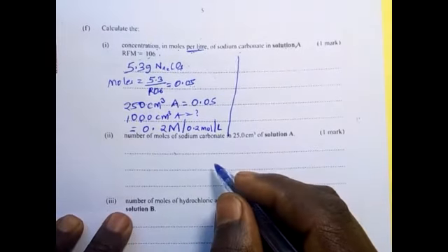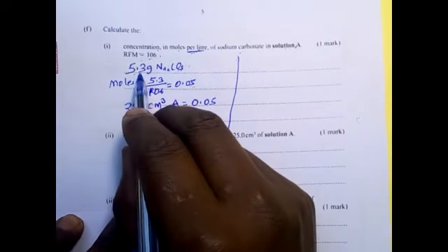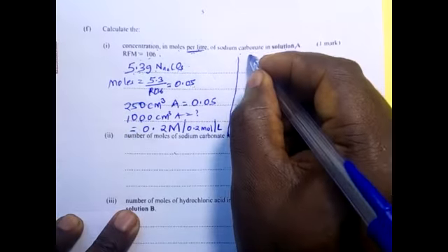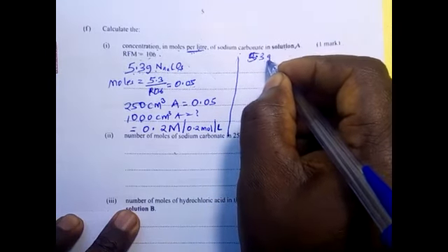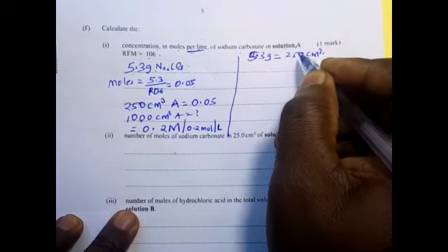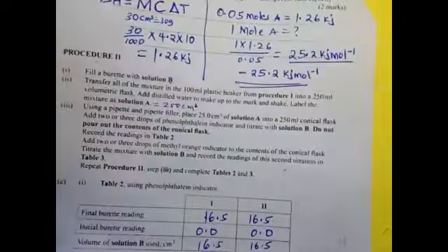Another person can say like this: we know that 5.3 grams, these are the number of moles that are in 250 centimeters cube. So we say 5.3 grams is in 250 centimeters cube, isn't it? Remember from the procedure, there are some things which you need to put in your mind.